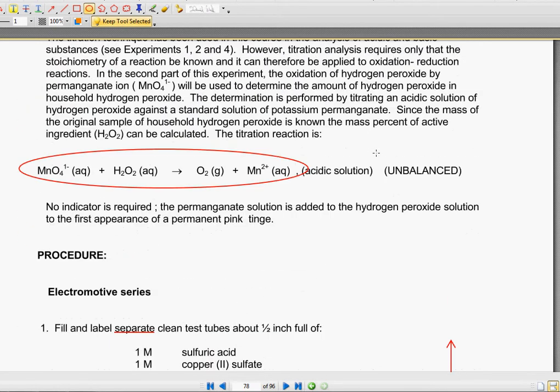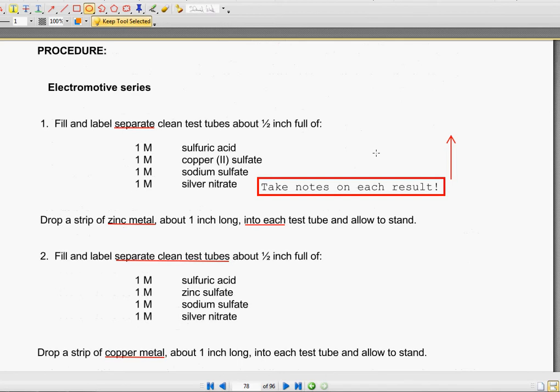So essentially, the first part of this is going to be the electromotive series. So we're just going to mix a bunch of different substances. You're going to have separate test tubes of sulfuric acid, copper sulfate, sodium sulfate, and silver nitrate. And we're going to drop some zinc into one of them and take notes of each result as it occurs.